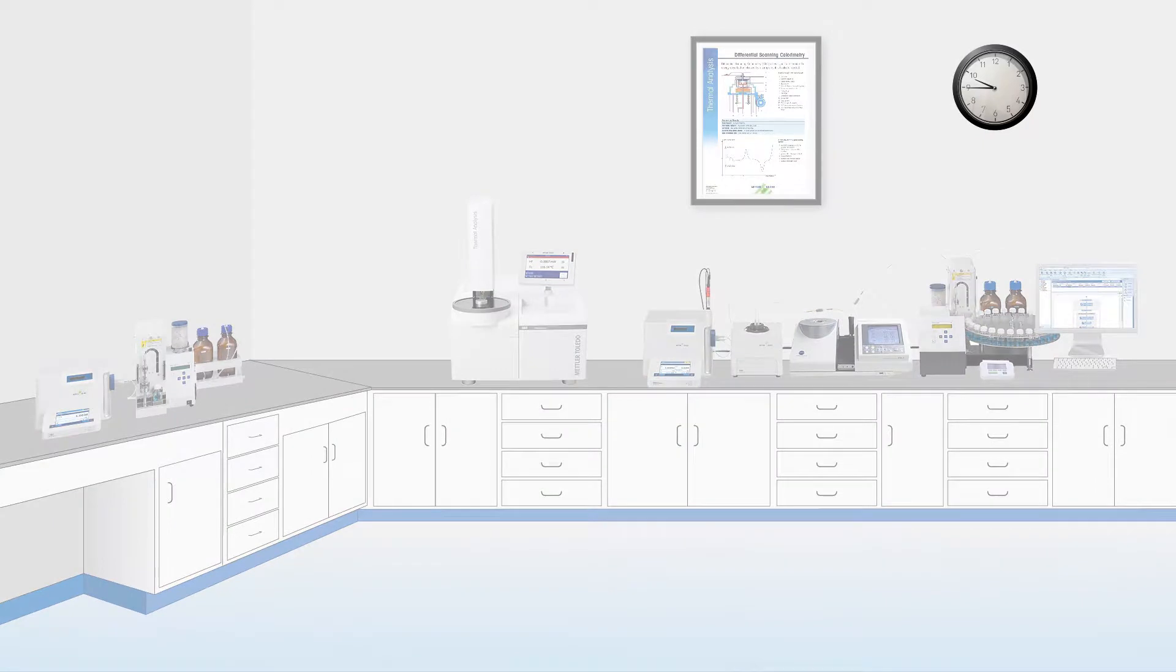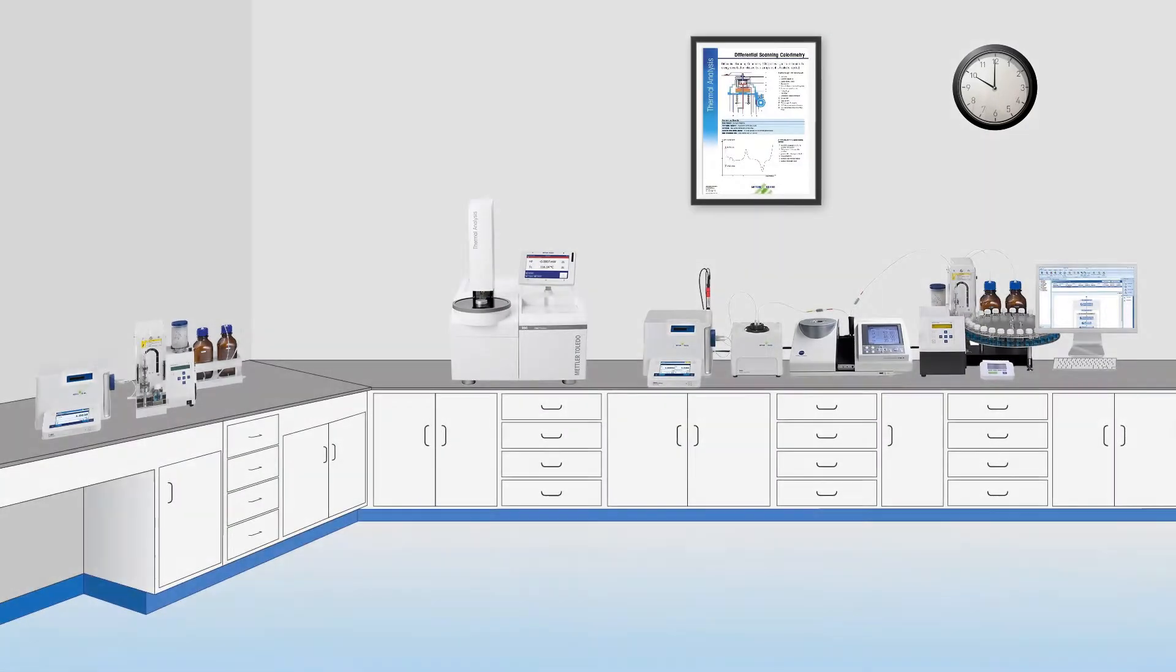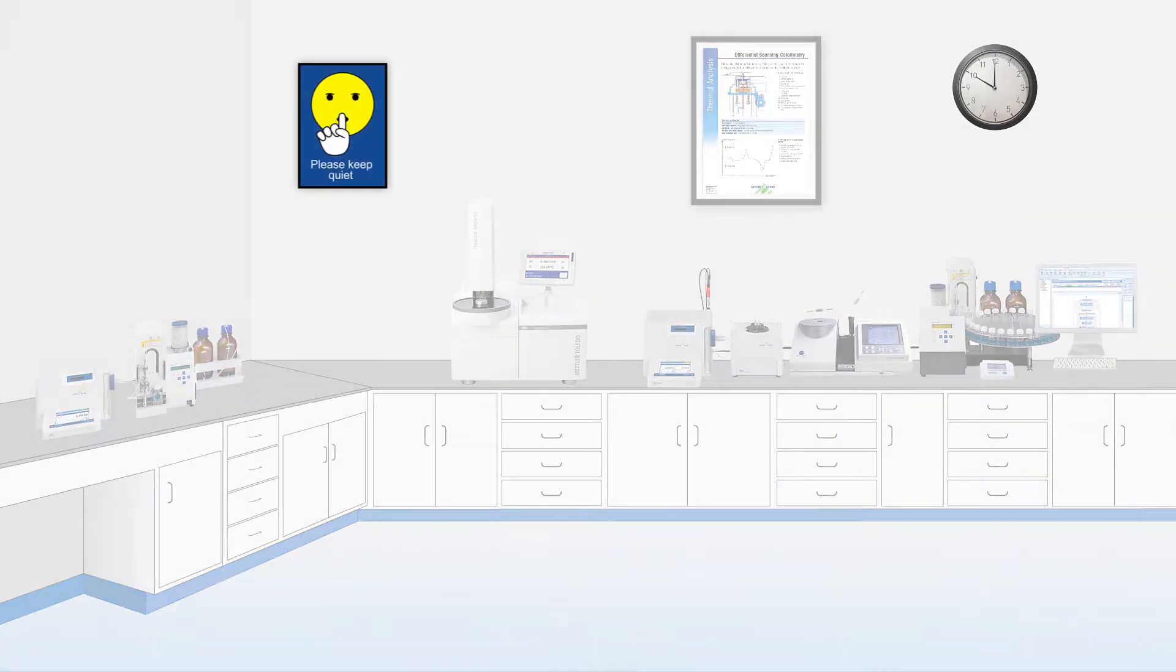METTLER-TOLEDO STAR-E Software allows the user to schedule experiments to start at any time. This is extremely useful for sensitive measurements that require a quiet lab.